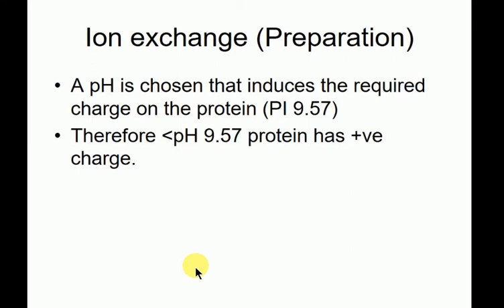The other issue you have, right? Let's say your protein had an isoelectric point of 9.57 and you're at pH 9.5. Then your protein has no net charge. It might fall out of solution. So charge is one of the things that keeps protein in solution. So usually, not always, as you approach the isoelectric point in terms of pH, your protein will just precipitate. So usually you want to know an estimate of your isoelectric point, and you want to keep the pH at least 1 unit away from that.